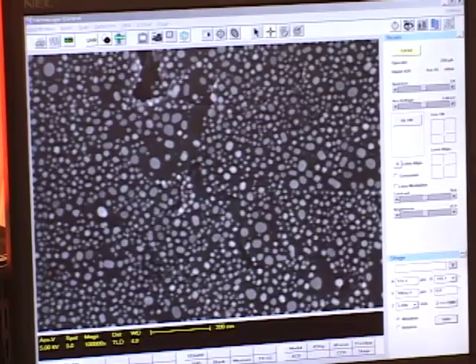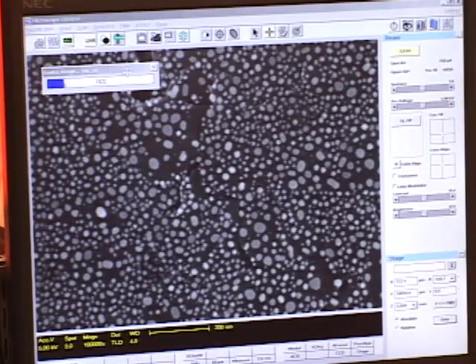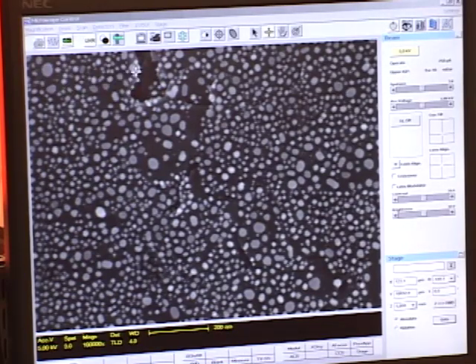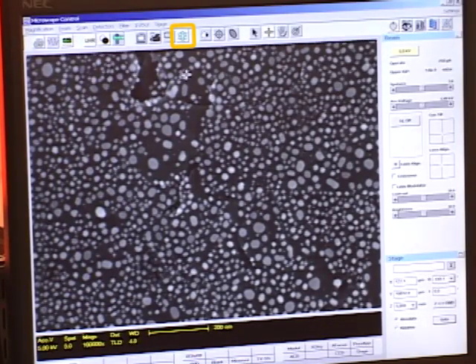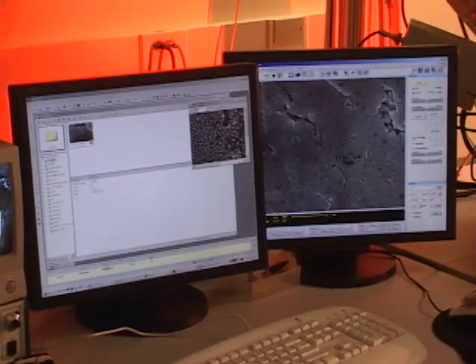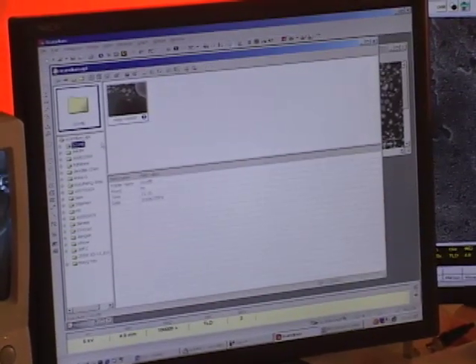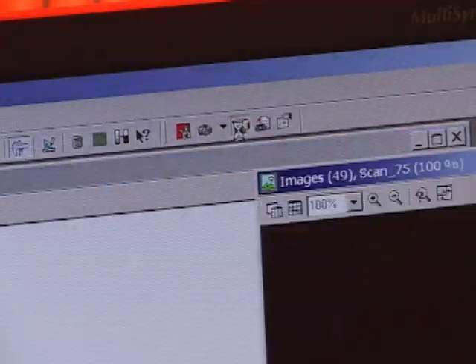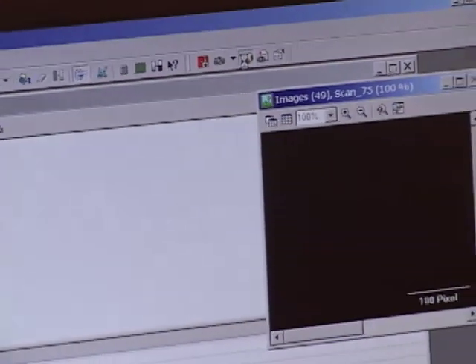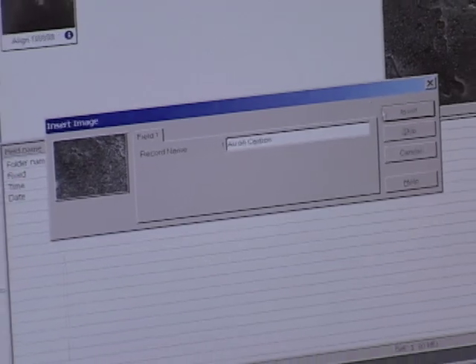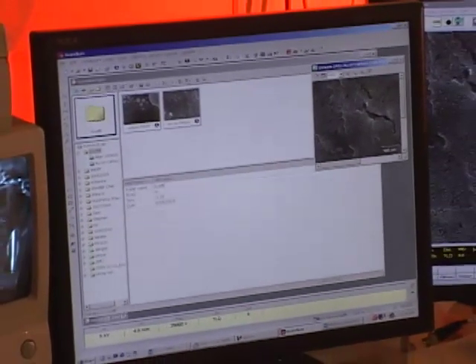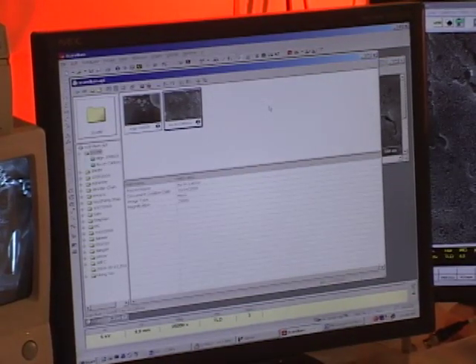But this image isn't saved — it's only frozen in the microscope control. In order to save it we need to transfer it into our database called Scandium. Once it's stored in Scandium I'm going to go back to live imaging by unfreezing the picture. Once the macro is finished, you transfer the image into the Scandium database by picking your folder from the left menu and then picking the camera with the yellow tube behind it — Snapshot to database Scandium. That brings the image over to the database and prompts you for a sample name. Click insert and now our image is saved in Scandium, and we can return to the microscope control to continue imaging.